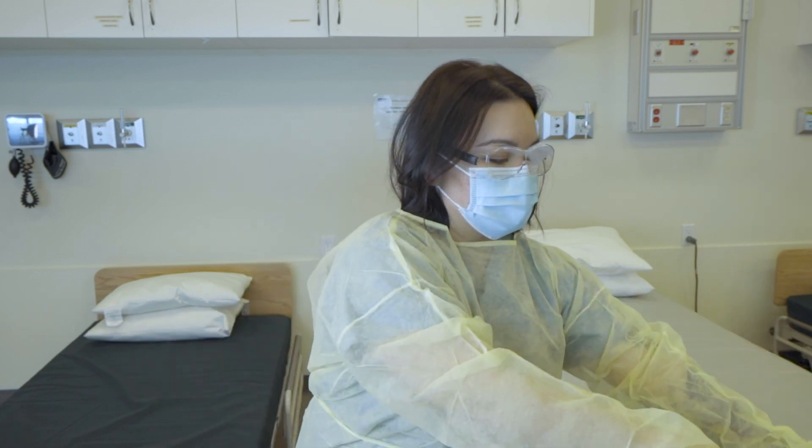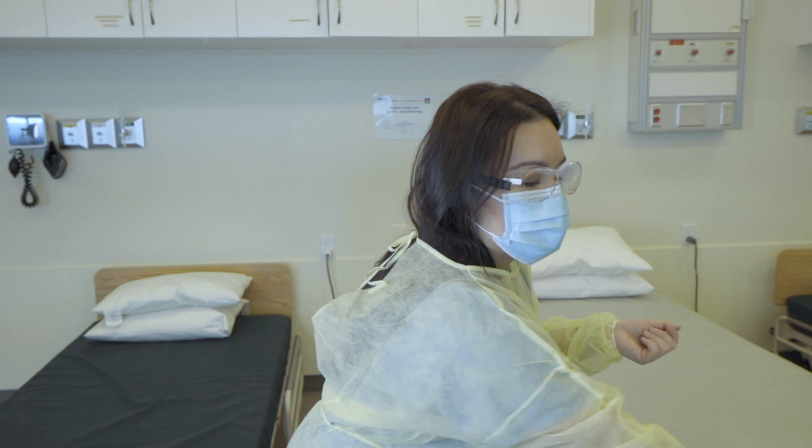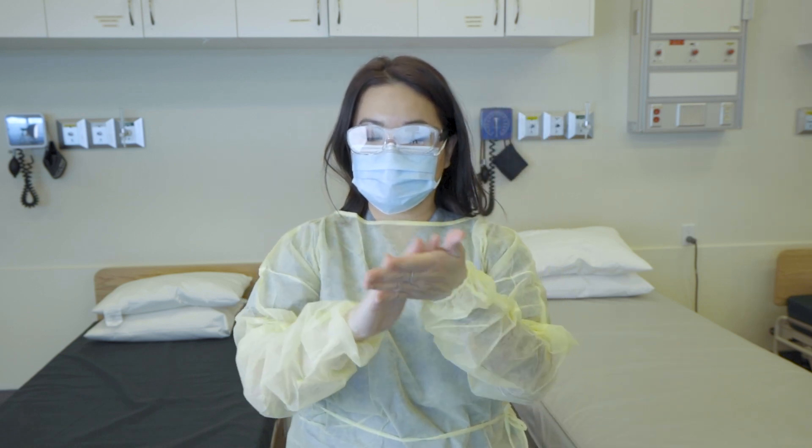And then at this point we would sanitize our hands. Hand washing may be necessary if your hands were in contact with soiled or organic material.